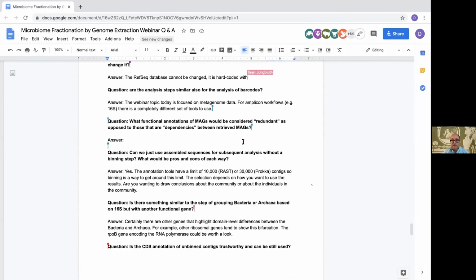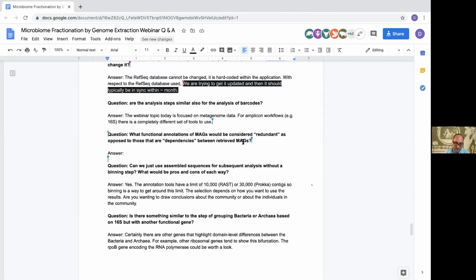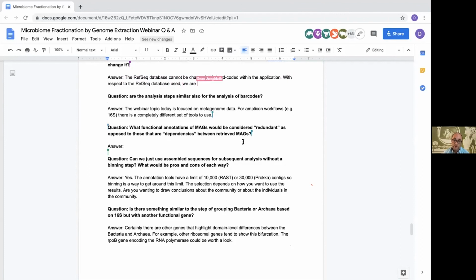Are both of those MAGs carrying out that pathway by themselves, or are they interdependent species? Or scenario 3, was it a MAG that wound up being sort of two medium quality MAGs that should be merged? Those are three possibilities and deserve a really close look.